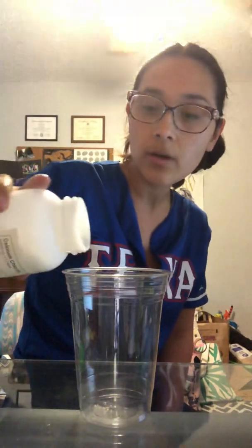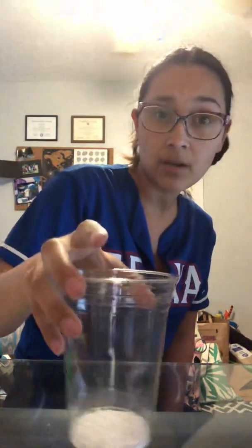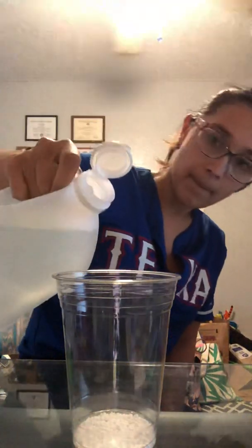Okay, so we're going to move on to the calcium chloride and vinegar. It's the next one over. So this is still calcium chloride, but now we're mixing it with vinegar instead of water. It's going to mix and mix here. There is a temperature increase. It is getting warm.